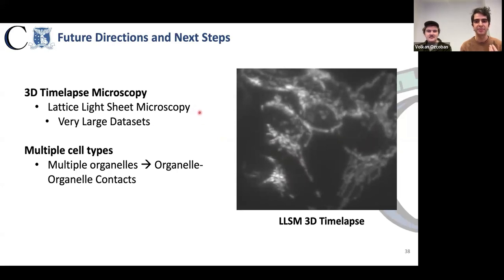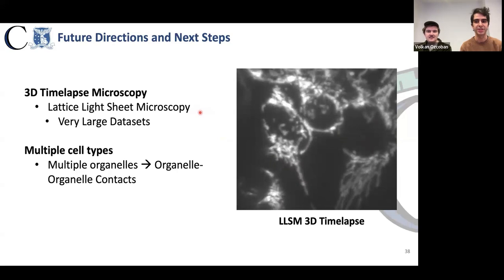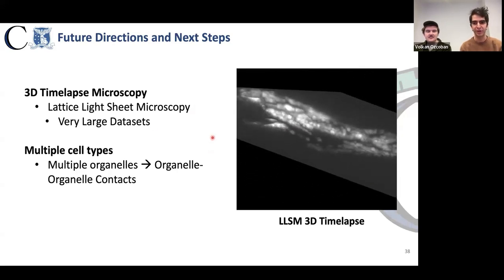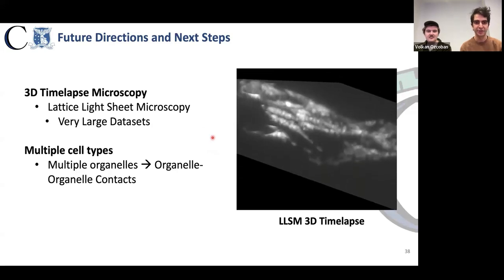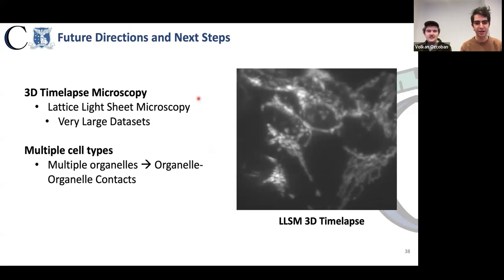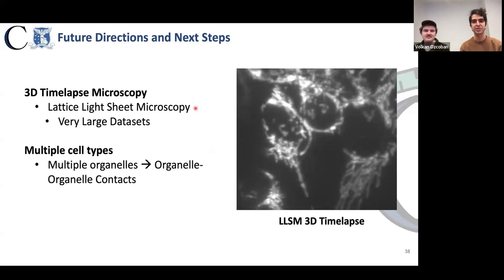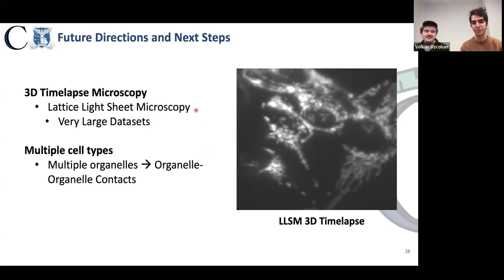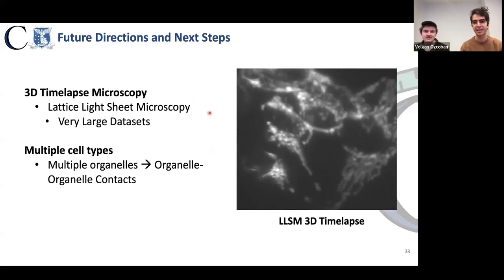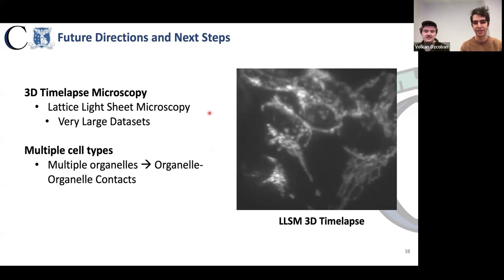At the same time, extending those pipelines to 3D introduces significant challenges, including more complex organelle morphologies, larger data volumes like we see in lattice light sheet microscopy, where we're getting terabyte to petabyte scale data sets, and the need for specialized 3D model architectures and tracking methods.